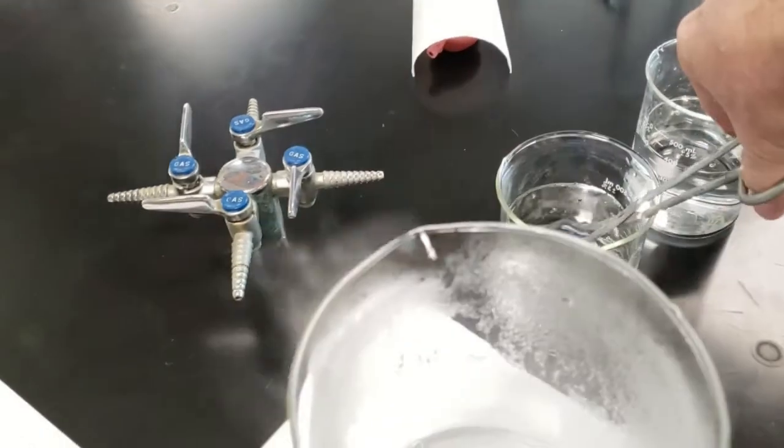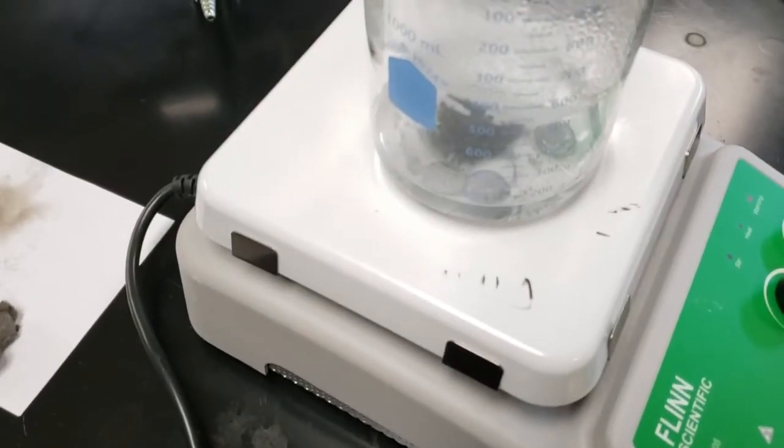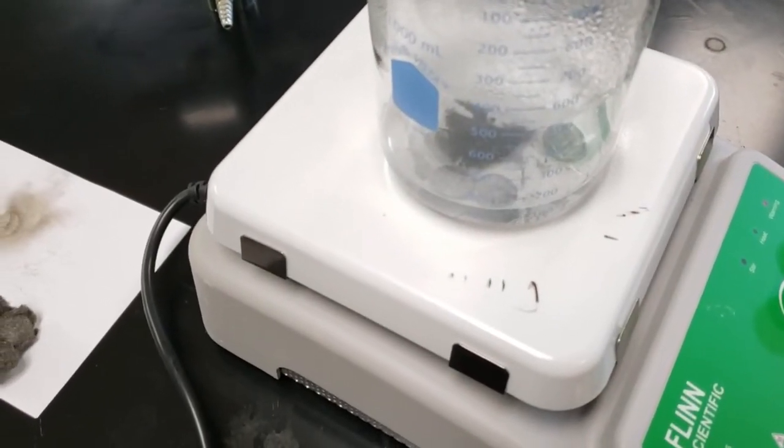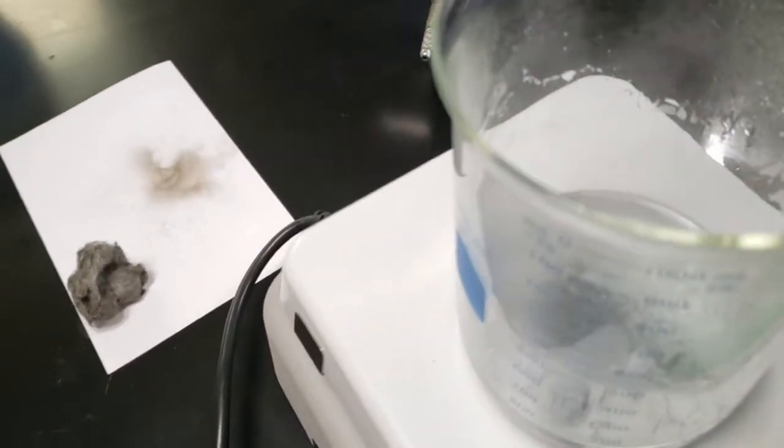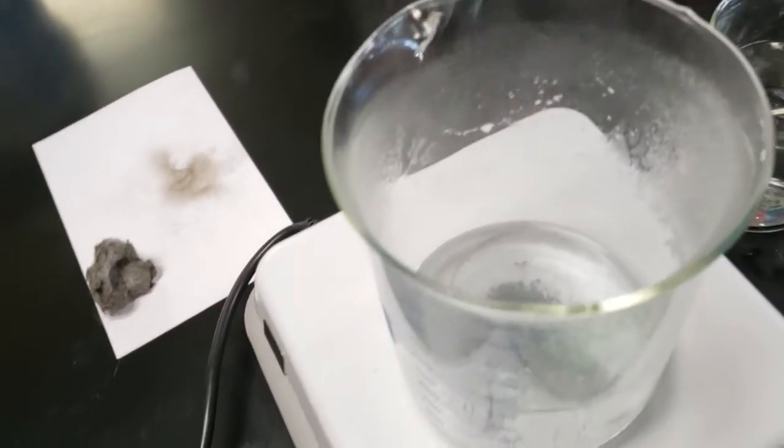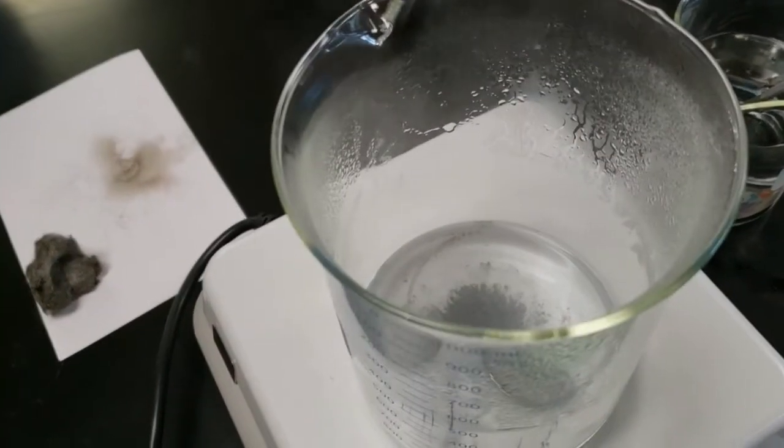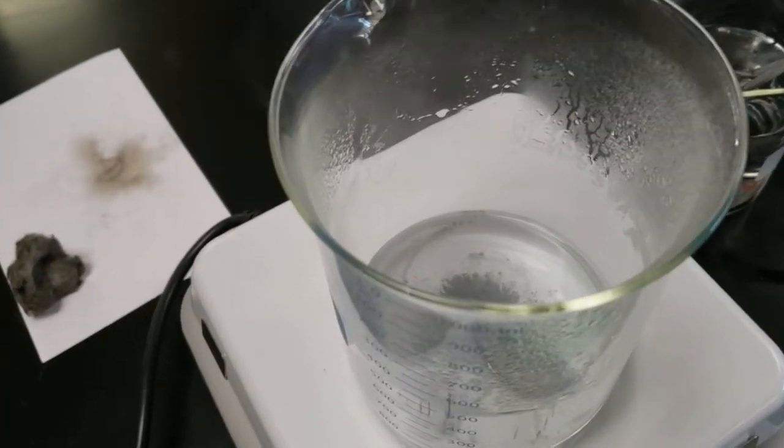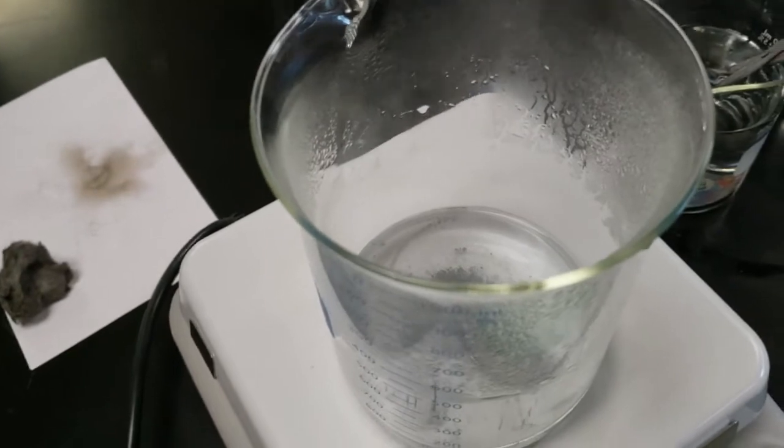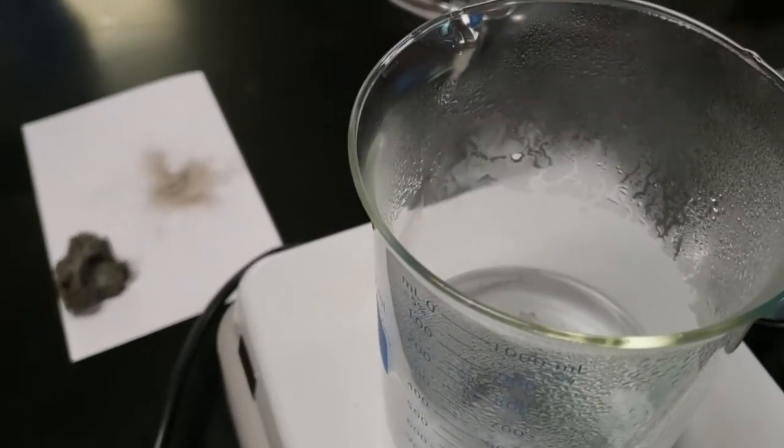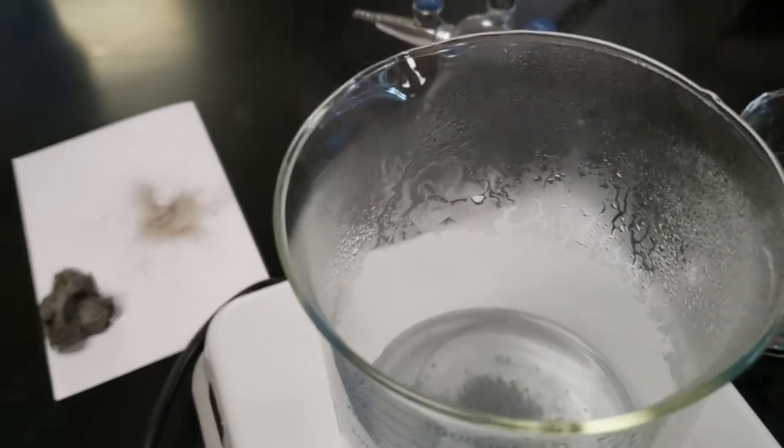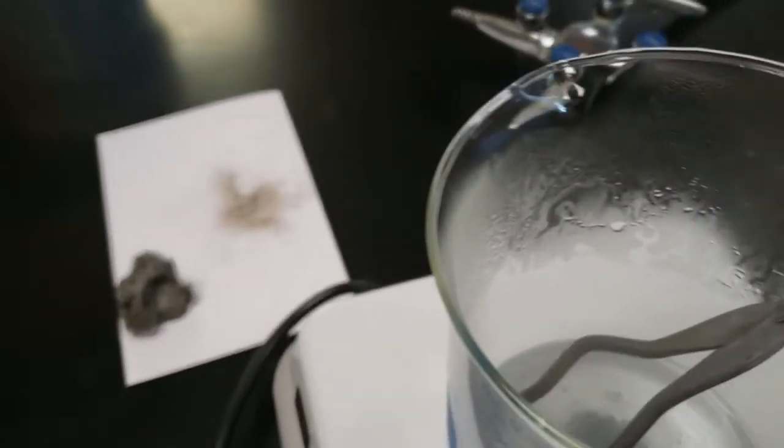You can always give it a little swirl, but go round and round, don't go back and forth. We don't want it to splash out. Now once we have these nice and silver looking, we're gonna use our tongs. I like them curved over and not up. Pick them out one by one.